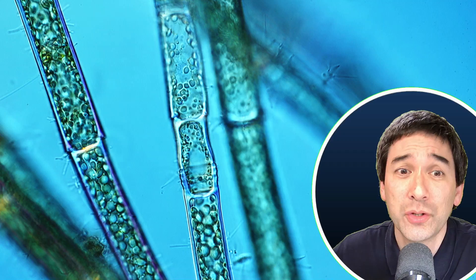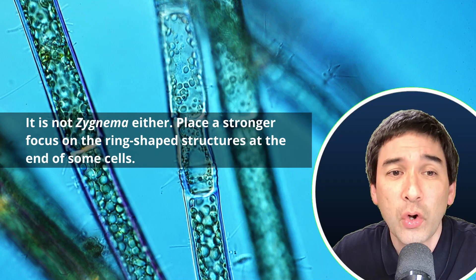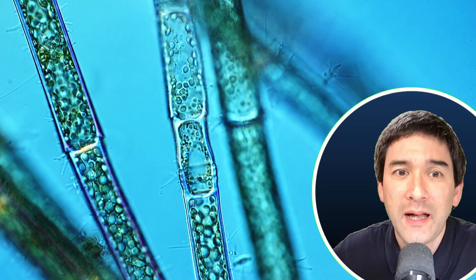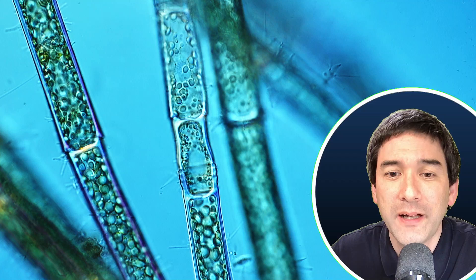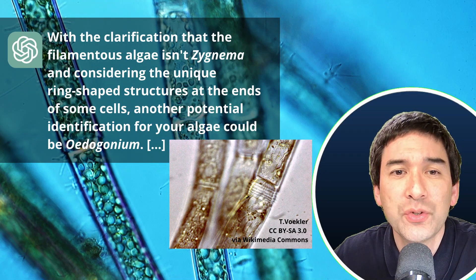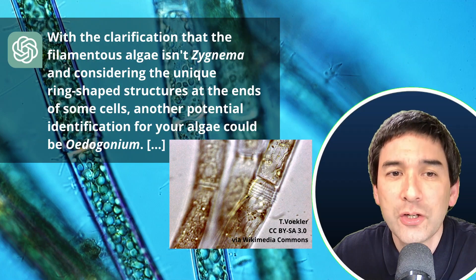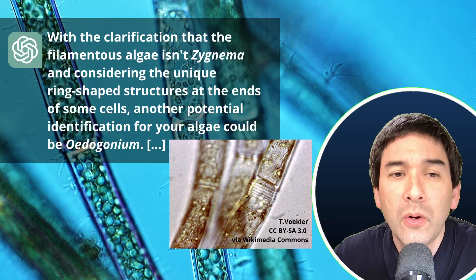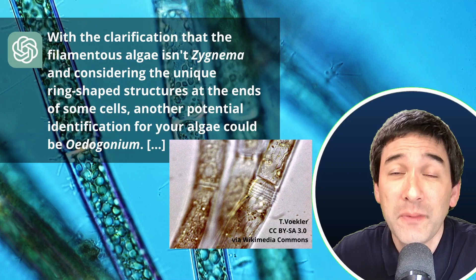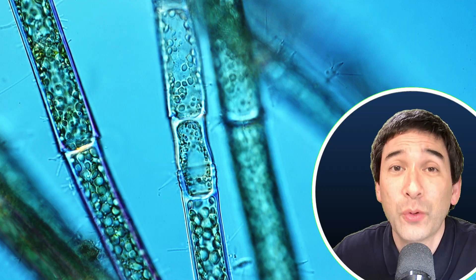So I decided, well, maybe I should really place a stronger emphasis on this. It's not Zygnema either. Place a stronger focus on the ring-shaped structures at the end of some cells. That's what I typed. And then it actually was able to identify it. Look, this is what I got here. With the clarification that this filamentous algae isn't Zygnema and considering the unique ring-shaped structures at the ends of some cells, another potential identification for your algae could be oedogonium. And that is indeed the correct genus. This is also a genus that I found out using my reference book and of course I also found online.